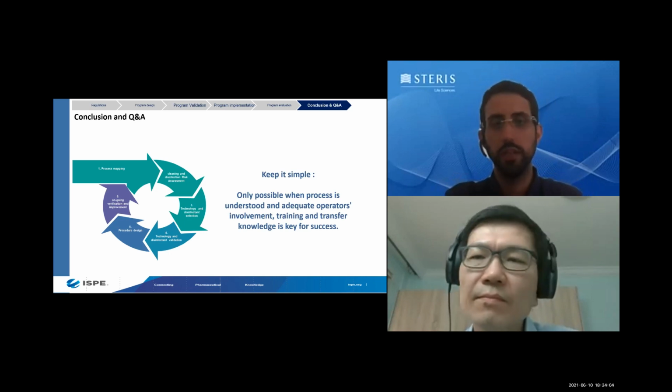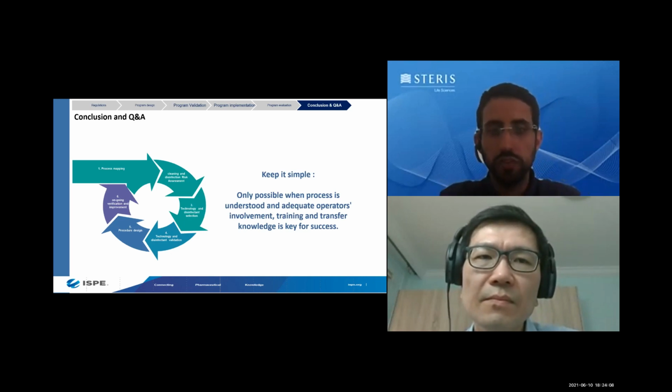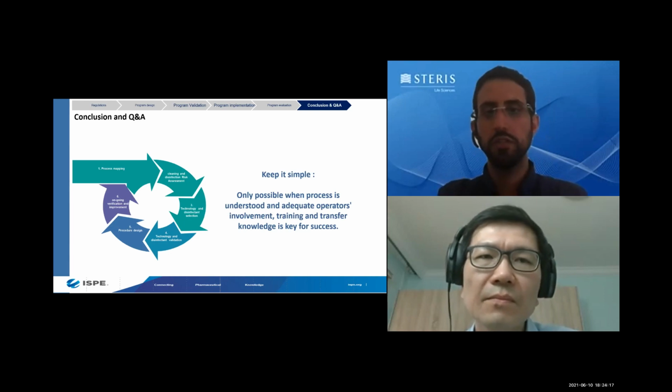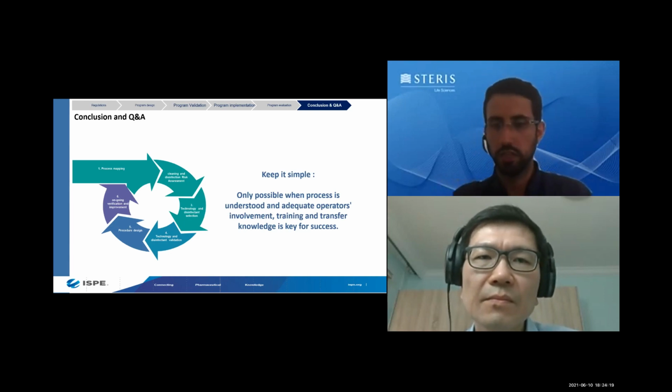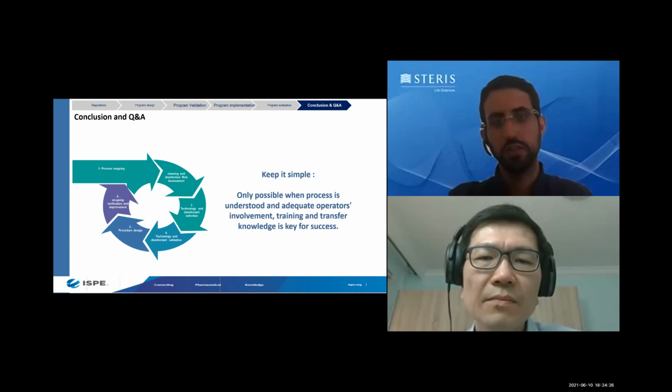Another thing with NaClO, bleach, is that you want to make sure you have removed any organic residue that may alter the efficacy of this disinfecting agent. If H2O2 is used as a VHP, then that should be okay. If it is used at 6 or 3%, then I'm not sure it will be efficacious at a normal ambient temperature wet contact time against a spore-forming mold or even a vegetative mold.